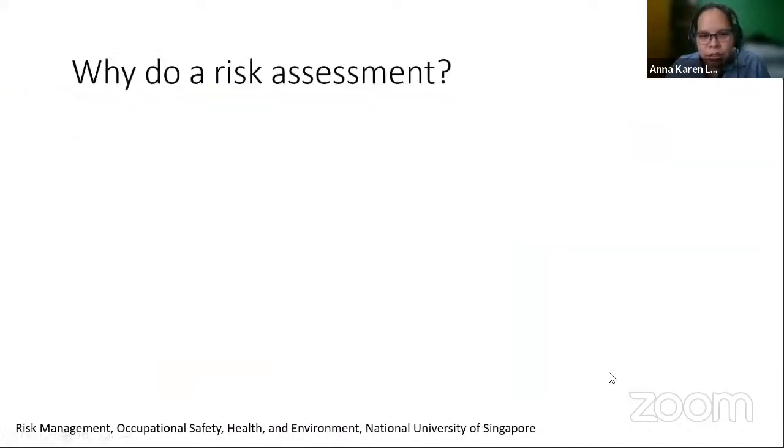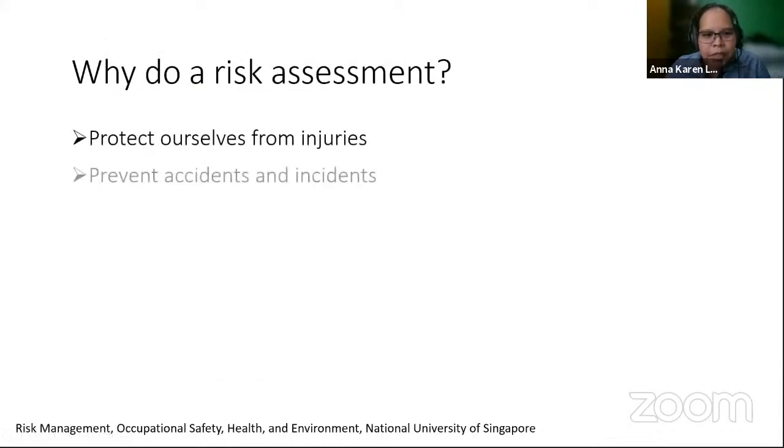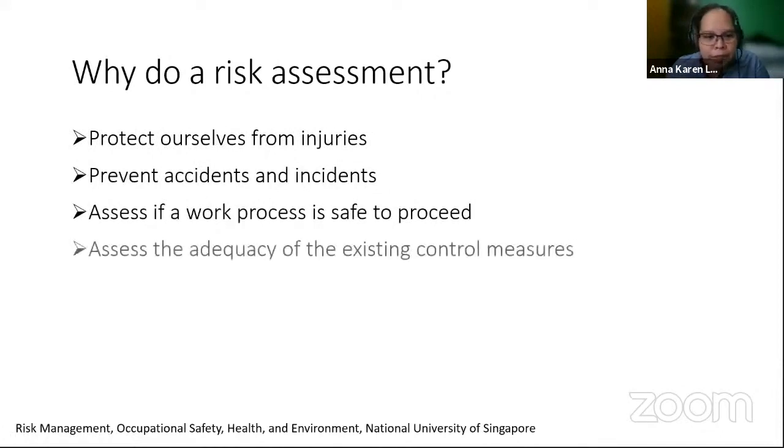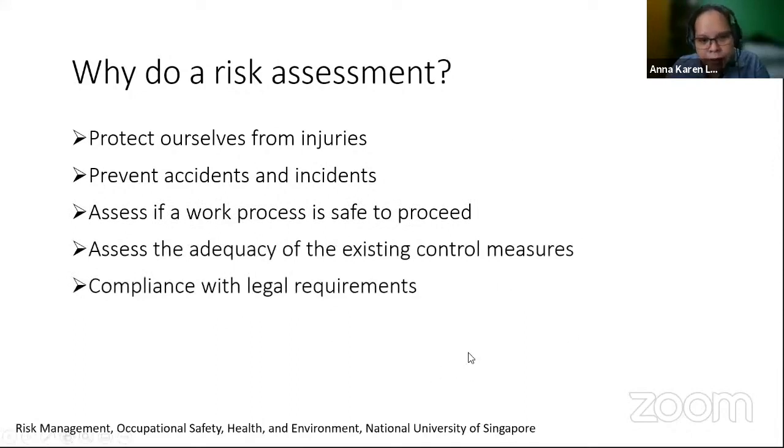Okay, so why do risk assessment? To protect ourselves from injuries, prevent accidents and incidents, assess if a work process is safe to proceed, assess the adequacy of the existing control measures, and ensure compliance with legal requirements. So I'm not sure.